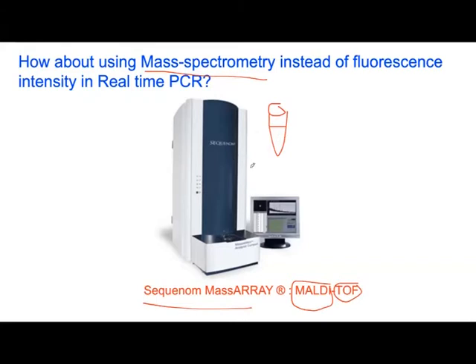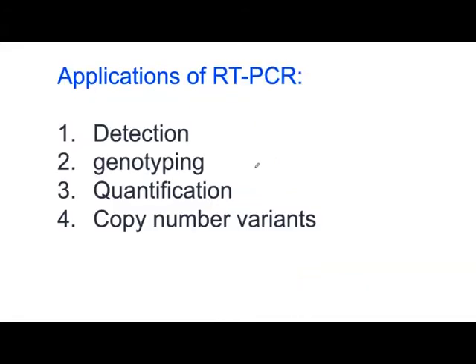And also the probes for this are cheaper compared to the fluorescent molecule. So again, this will give you a cheap result and much more multiplexing if you want to use MassARRAY, mass spectrometry for detection. So here I'm trying to summarize what we discussed so far.